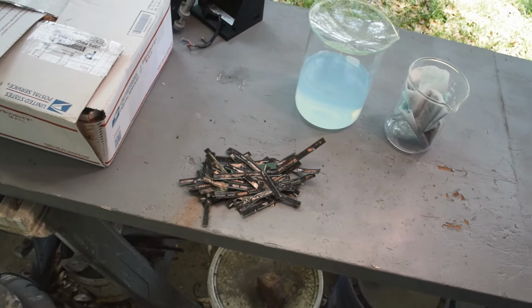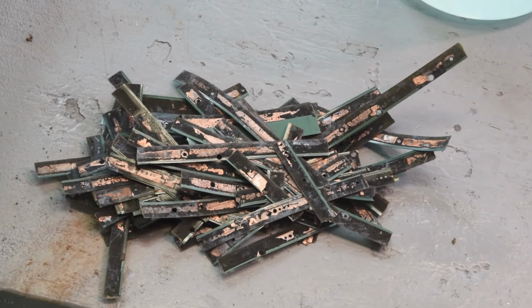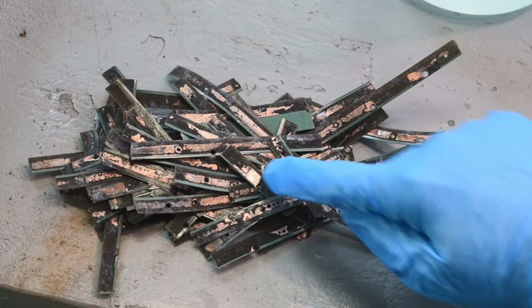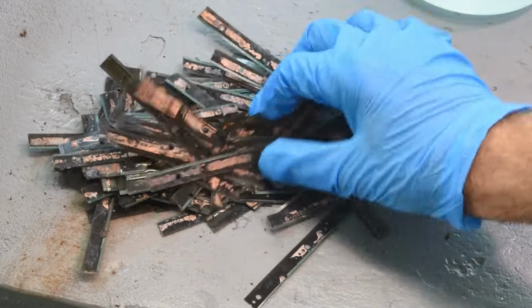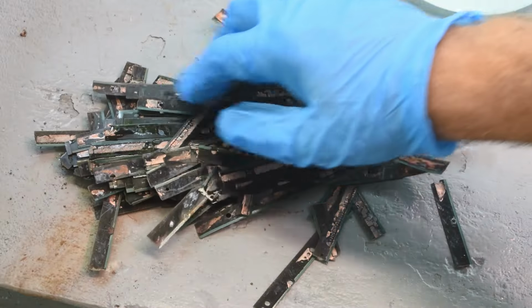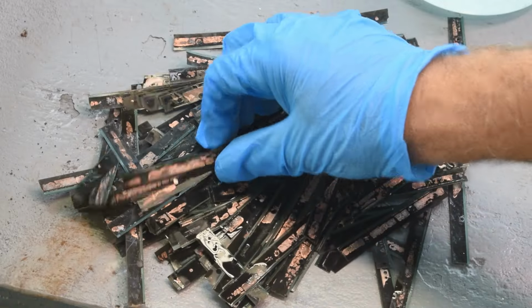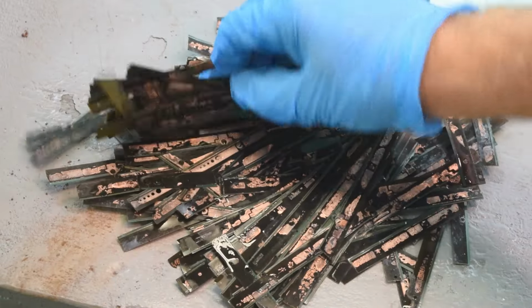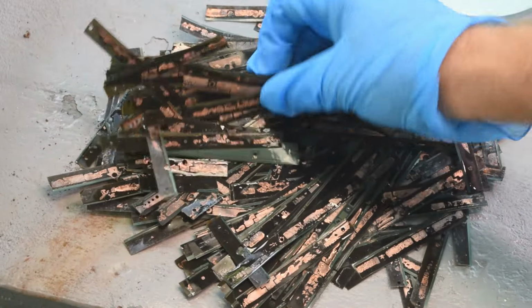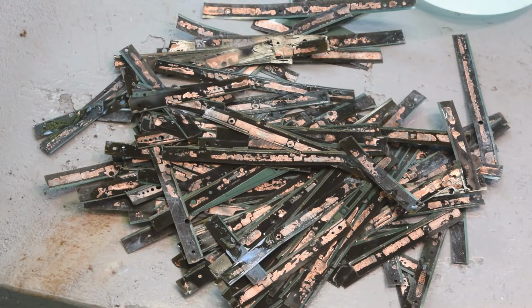If we take a look at the leftovers here, I hope it's showing up. There is a little bit of palladium still here. Not much. I think we got the bulk of it. Just in a few spots. Some of this might even rinse off if I was to try rinsing it again. Yeah, it's pretty loose. So we got the bulk of it. There's some more that's stuck on right there. So I would say we got 99.9% of the palladium out of this stuff.